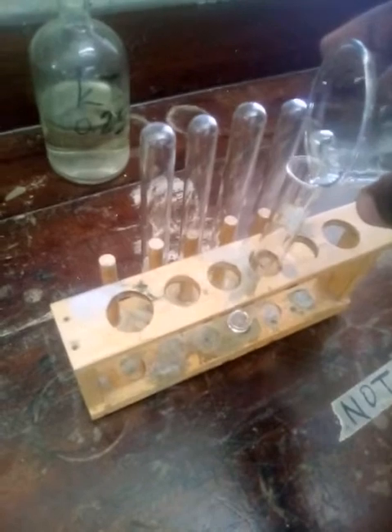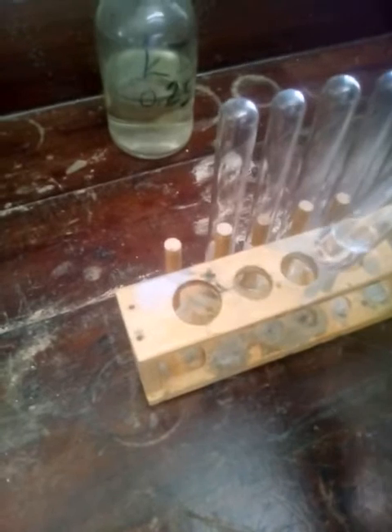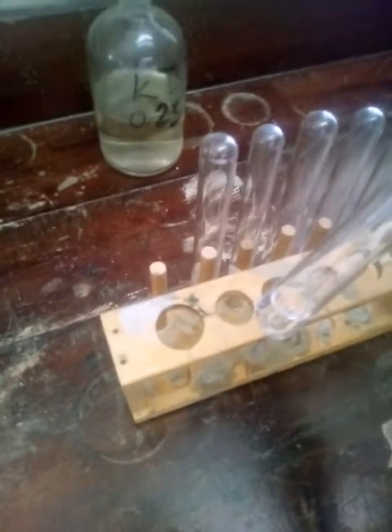So we're going to add the potassium iodide now in the test tube. So you can see the color in the test tube. As I said before, it's not colorless. It has a shade, but it's closer to colorless than to an intense shade. So this is our potassium iodide in our test tube.